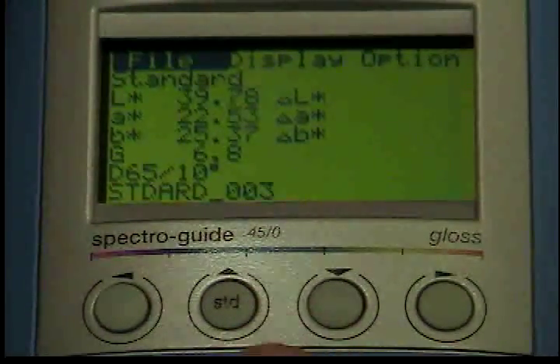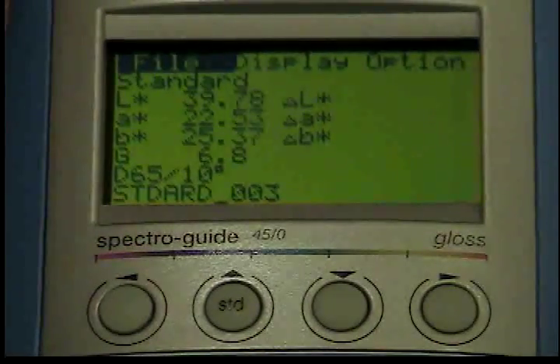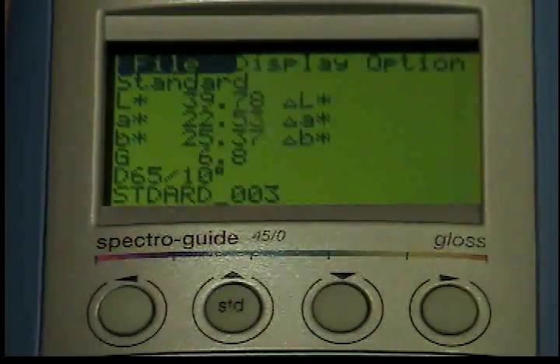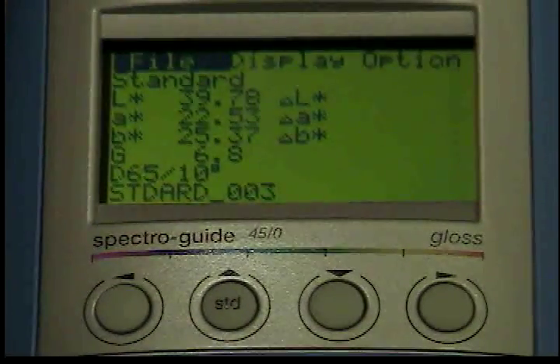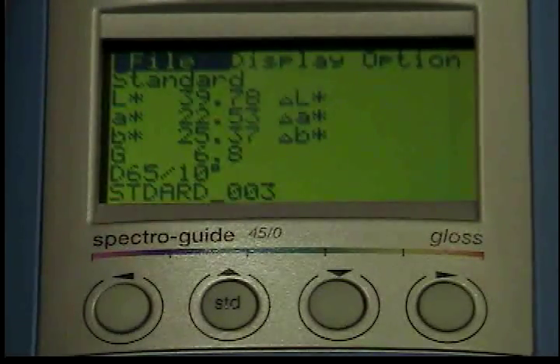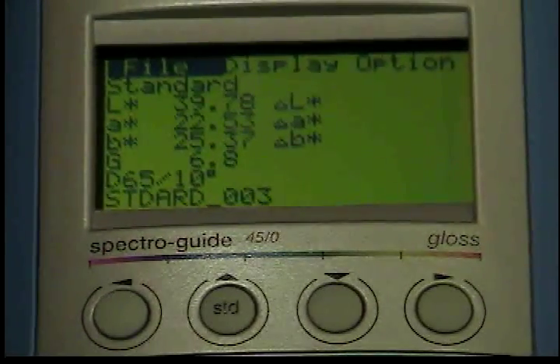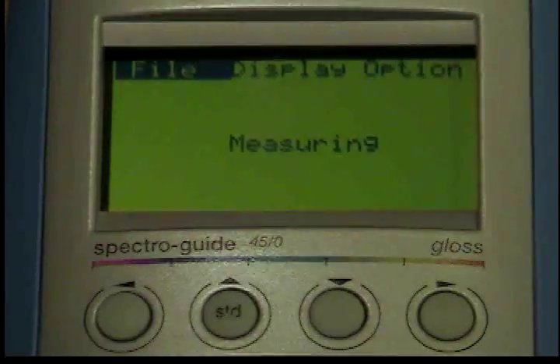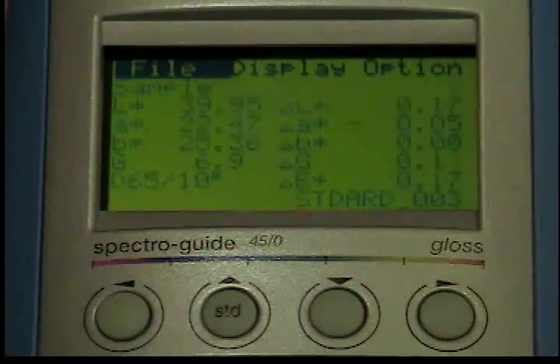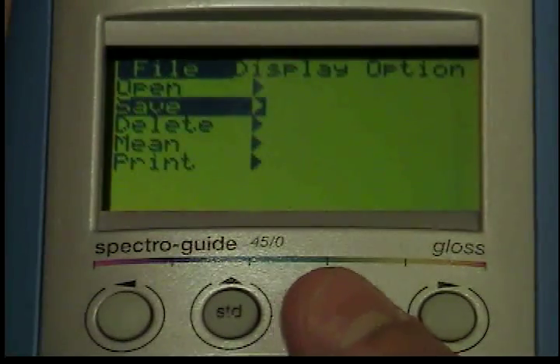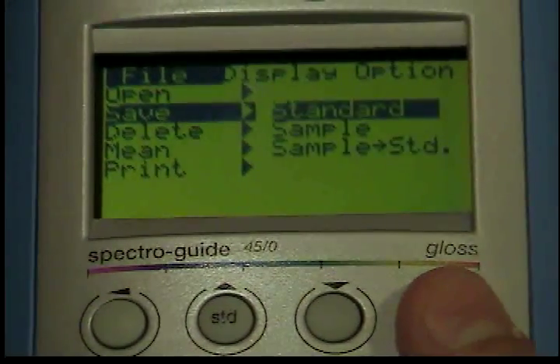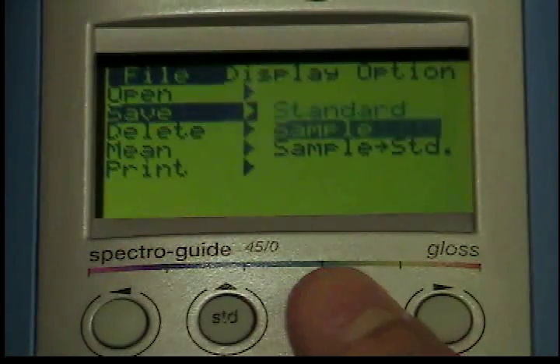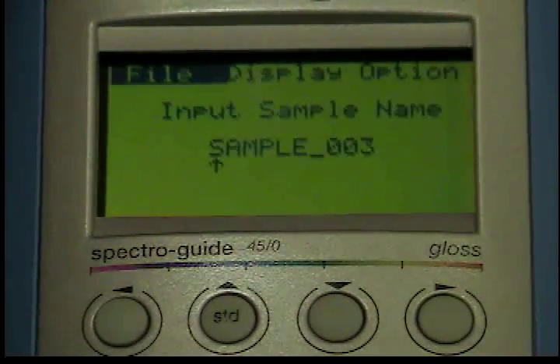If you started the measurement with the up button, you can store it as a standard with the save standard function. If you started the measurement with the operate button, you can store it as a new sample with the save sample function. You can also save the sample as a new standard by using the save sample as standard function.